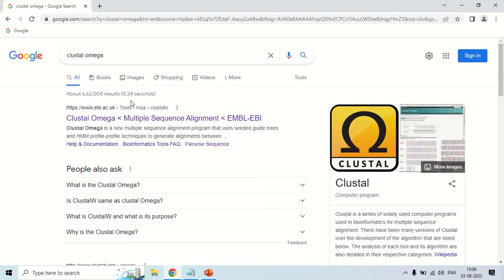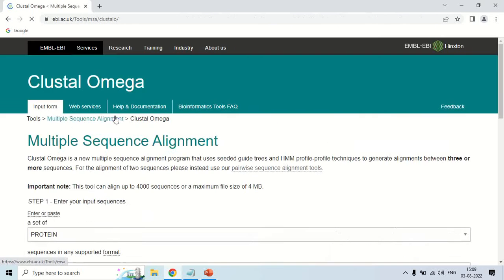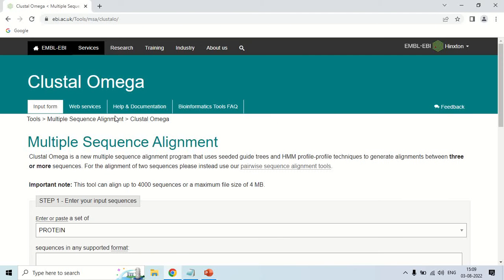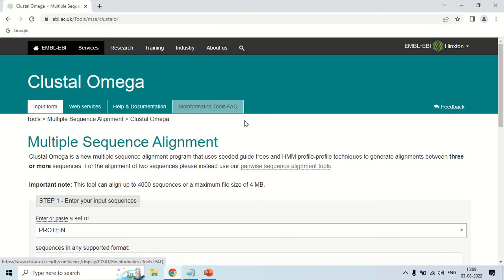EBI stands for the European Bioinformatics Institute. Just click on this website and now the website is open. This is the home page of the Clustal Omega software.